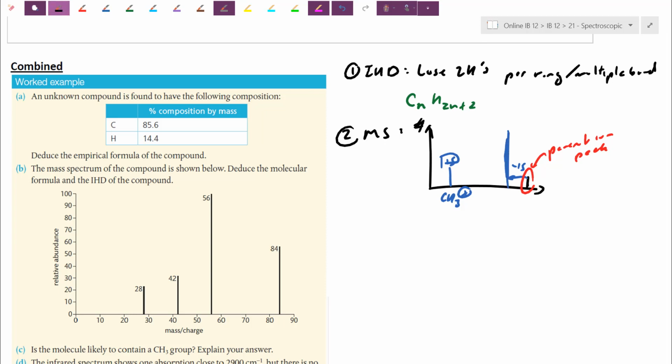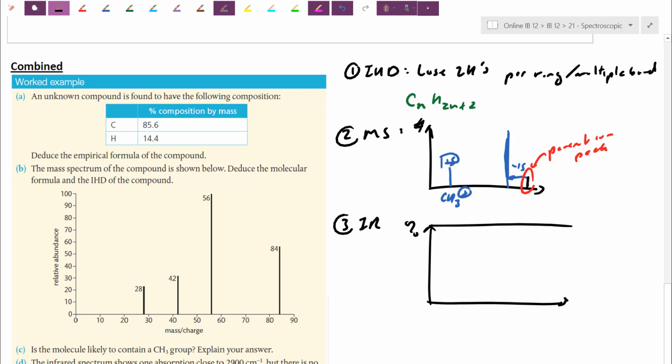Using IR radiation, remember we send in a baseline, we plot a percent transmittance. We're fully expecting all this IR radiation I send in to fully get through, but based on a particular wave number, a way to measure energy in units of centimeters minus 1, if it was exactly the right amount of energy, particular bonds actually absorb.